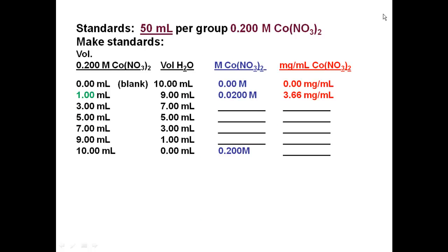For this experiment, you need 50 milliliters of 0.2 M cobalt nitrate, and you'll make your standards from that. Take zero milliliters of standard and ten milliliters of water — pure water — as your blank (zero molarity). Then take 1 mL of 0.2 M and 9 mL of water; then 3 mL and 7 mL; then 5 mL and 5 mL; then 7 mL and 3 mL; then 9 mL and 1 mL; and finally pure 0.2 M cobalt nitrate with no water added. The volumes between cobalt nitrate and water all add up to ten milliliters total.